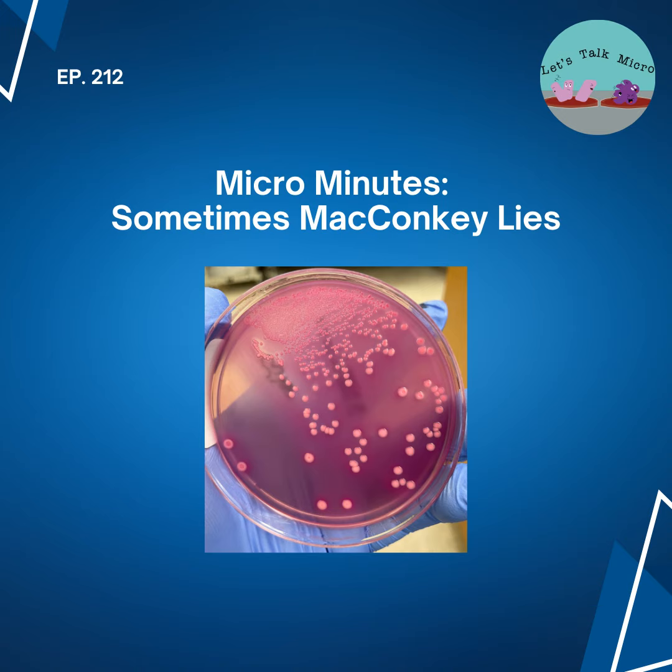If you do so, then you might end up setting an ID card, get a wrong identification, and once again, you might potentially put your patient in harm. So, bottom line, if you see those small colonies, do a gram stain and then subculture to another plate, like a Candida agar plate or a blood plate, so you can do more testing. But remember, yeast can grow on MacConkey.